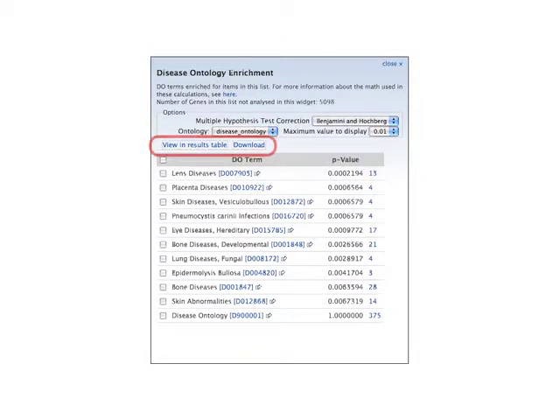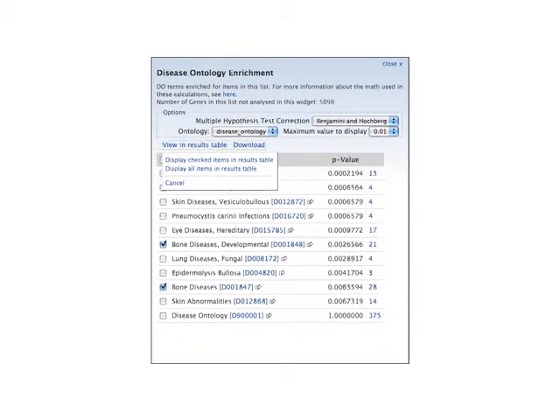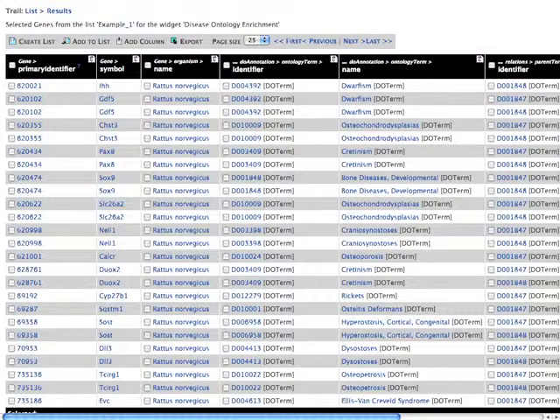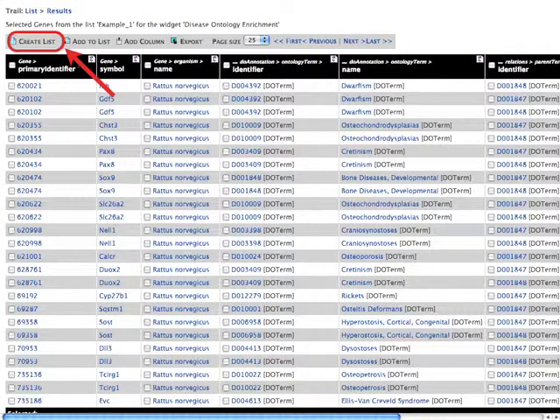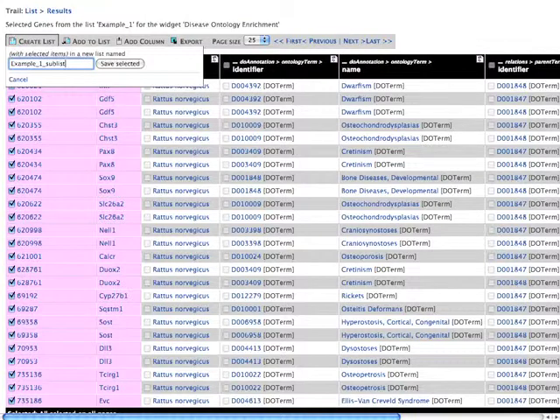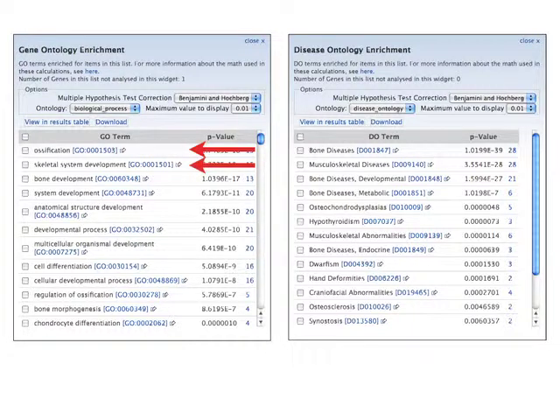The results of these widget analyses can be downloaded for use in other applications, or some or all of them can be viewed in a results table within RatMine. For instance, if we check the two terms related to bone diseases in this example and choose to display checked items in a results table, we see the annotations for either those terms or more specific child terms underneath them in the ontology. One of the great advantages of the RatMine tool is the ability to then save this list and use it for further analysis, either using these same term enrichment widgets or other RatMine list manipulation tools, such as looking for overlap between this list and another. Here we've saved the shorter list and found that the enrichment analysis for this subset of our original set of genes, not surprisingly, includes terms such as ossification and skeletal system development for the GO biological process ontology, and hypothyroidism and musculoskeletal abnormalities from the disease ontology.